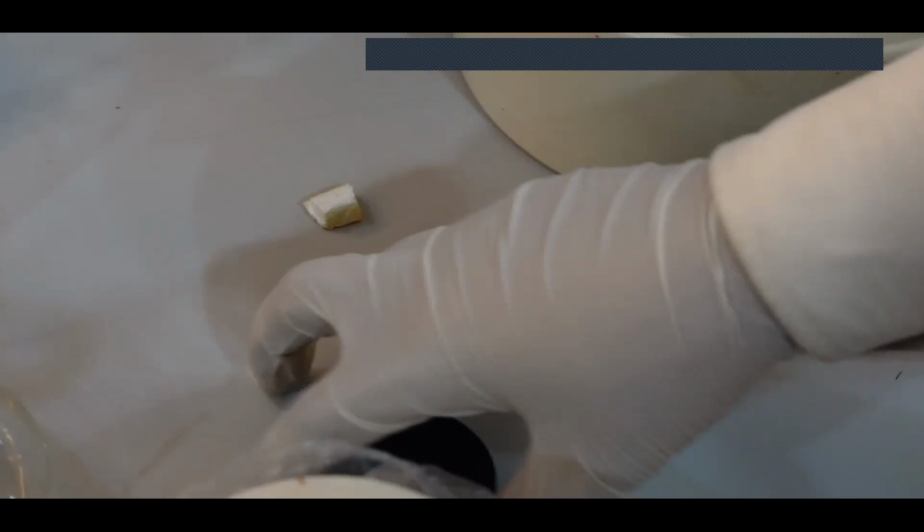Okay, so first of all, why am I wearing gloves? For safety precautions. What safety precaution? Be specific. Maybe the metal is reactive. It is reactive with my skin, right? And that is why I need to wear gloves.